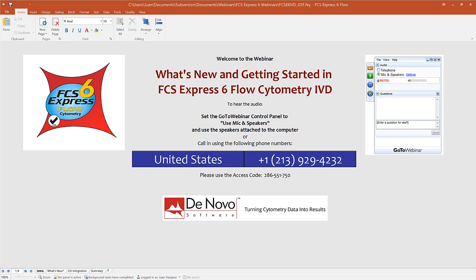And on today's webinar, we're going to focus on our newly released FCS Express 6 Flow Cytometry Clinical Edition. I'd like to focus on a lot of the new features that are now available in FCS Express 6 and also give a high-level overview of getting started using the software. For starters, I'd like to show you several examples of different tools that are available in FCS Express and also different things that you can do to help analyze your data using our software.